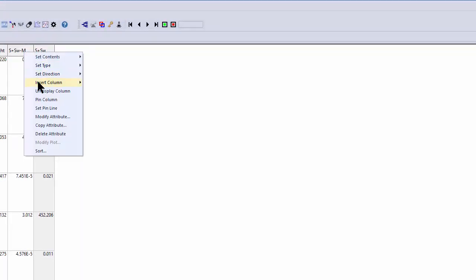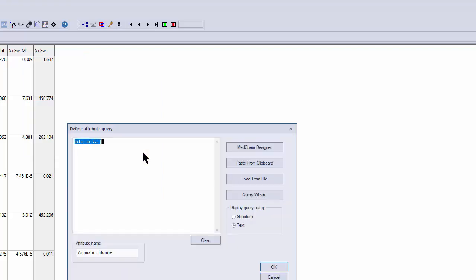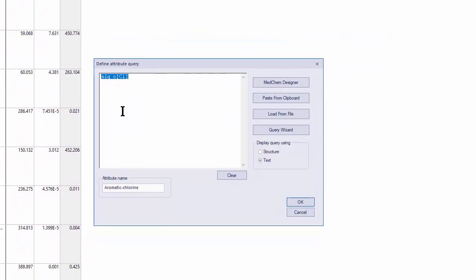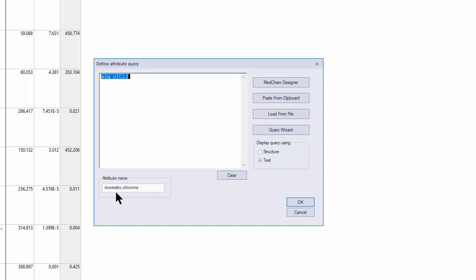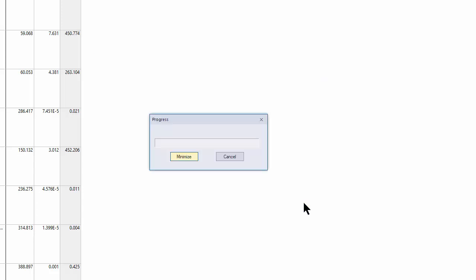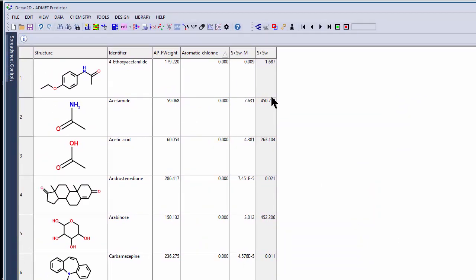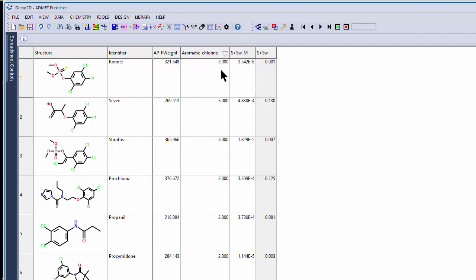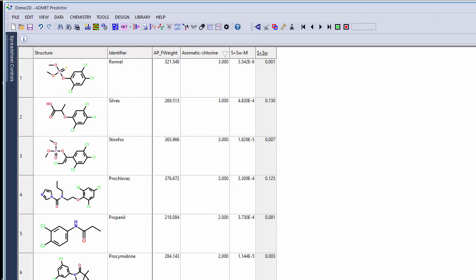Another thing you can define is a new query attribute. I'm going to use a SMARTS query which will be an aromatic carbon attached to a chlorine. I'll call the new column name Aromatic Chlorine. When I click on that, it performs the query and adds this column. Sorting in descending order, you can see it's showing the number of these groups — chlorine, chlorine, three chlorines in several of these, then a single one or two also.